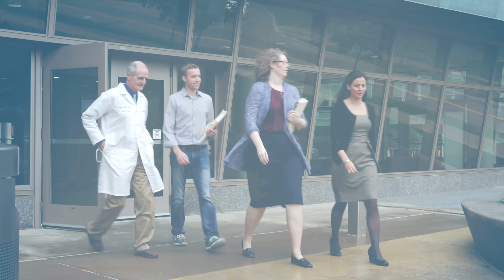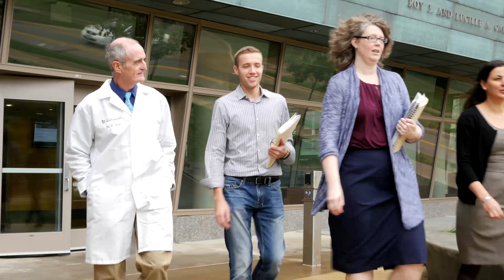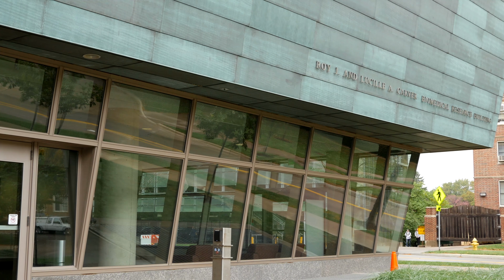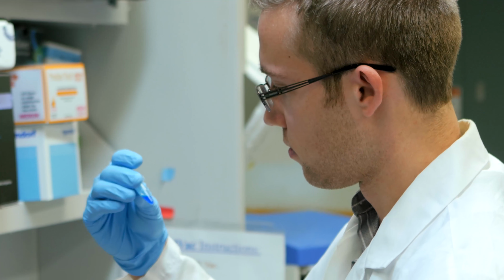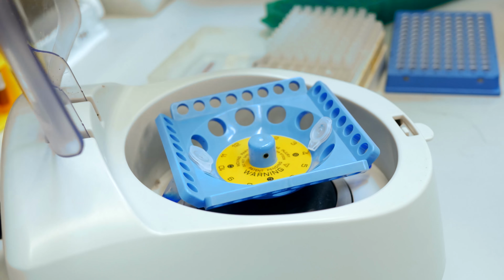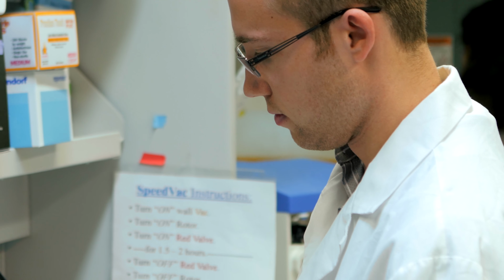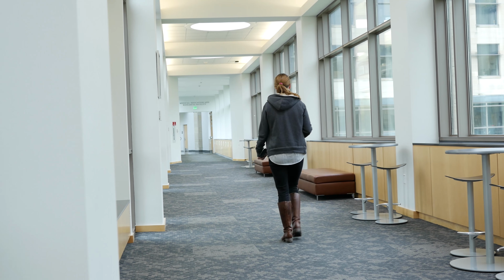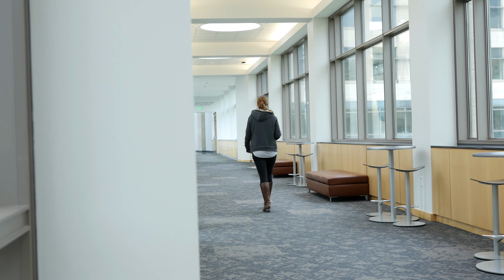When we started down the path of hearing loss research, we wanted to focus on targeted sequence capture, a limited number of genes, and we wanted to partner with industry because nobody had made a platform for any disease indication. We partnered with Agilent. Doing this is huge because we help people not just here in Iowa and not just the people who come to see me, but we have a global outreach.